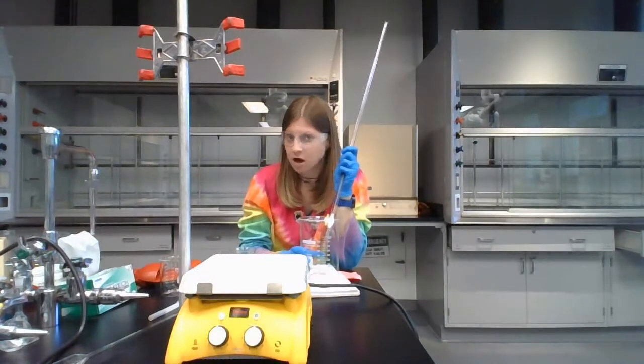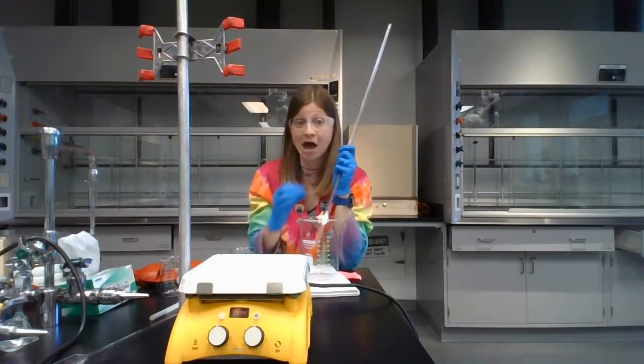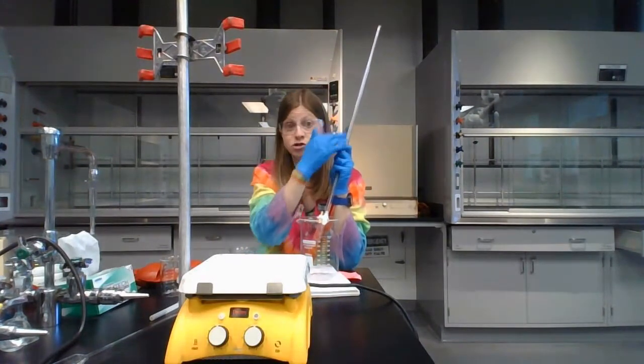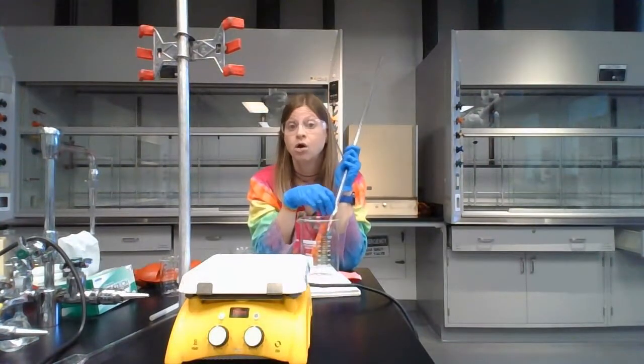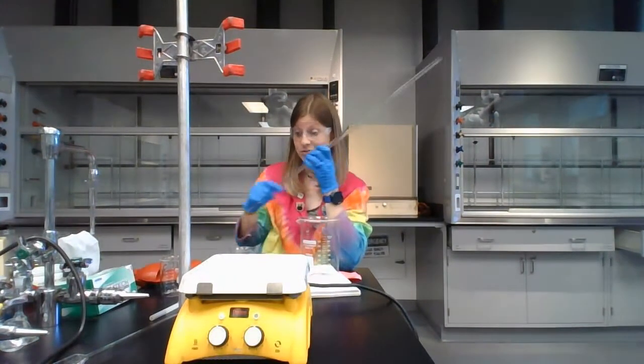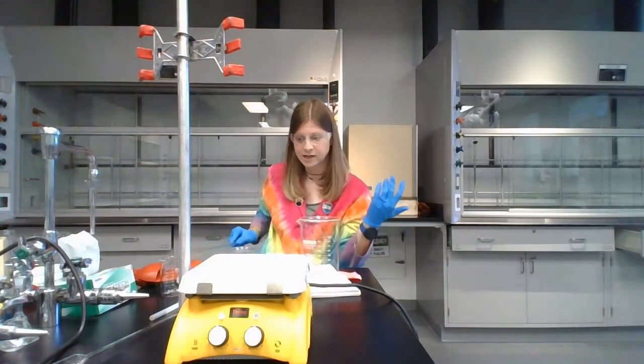Because we just mixed oxalic acid with pure purple potassium permanganate, so now it's a mixture. What we're doing is we're reacting the potassium permanganate to get it out of the burette. Rinse this until there's no longer any purple color stuck to the inside of the burette. Okay. Once that has happened, you can put your burette in the designated container.